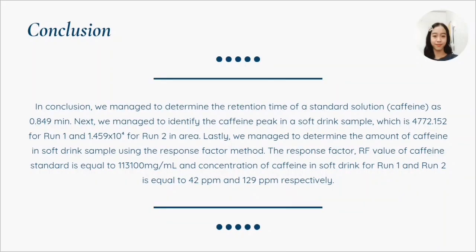In conclusion, we managed to determine the retention time of the standard solution caffeine as 0.849 minutes. Next, we managed to identify the caffeine peak in the soft drink sample, which is 4,772.152 for run 1 and 1.459 times 10 to the power of 4 for run 2 in area. Lastly, we managed to determine the amount of caffeine in the soft drink sample using the response factor method.